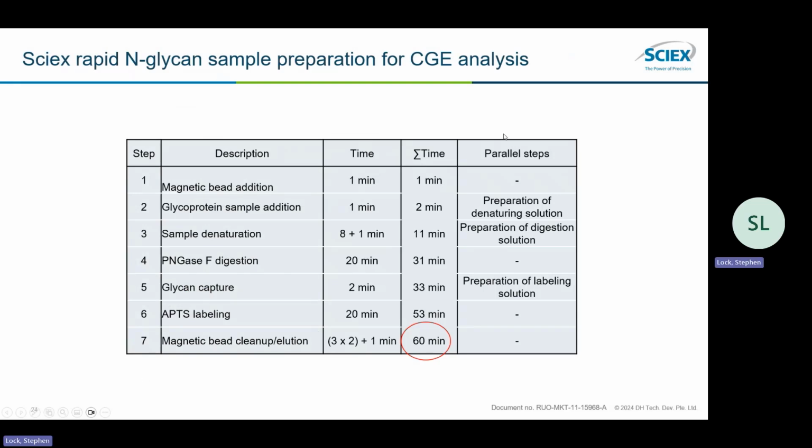As I mentioned, if you put all these methods into a table, you can see that the total runtime with this cleanup is around 60 minutes.